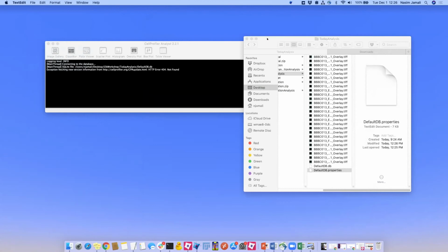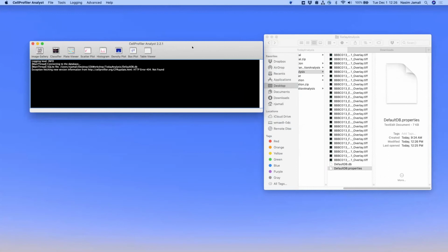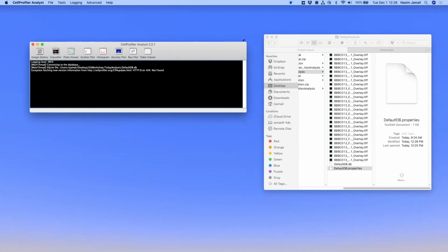We usually would send you to breakout rooms, and so you can again follow along from the PDF file, but in the interest of time and making sure that everybody follows along, I'm just going to demo. Feel free to ask questions in the middle, and if you get time, feel free to also follow along, open it, and follow the steps with me.